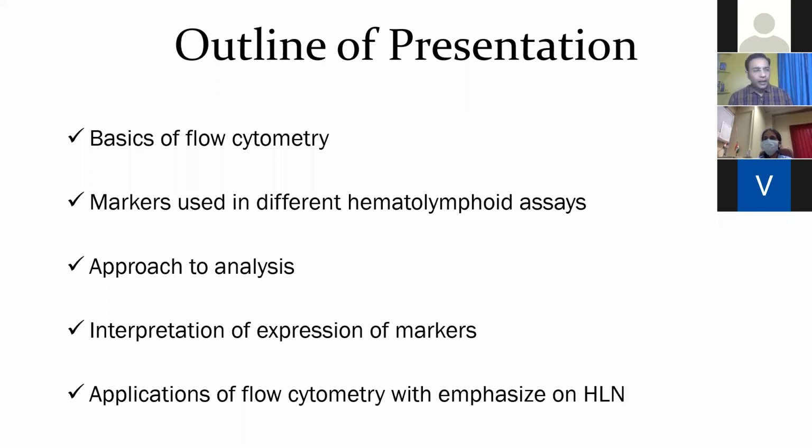And many times you get reports which show what the marker is, and how it is represented in the report, either in percentage form or in expression form. Second, sometimes you can also get dot plots, especially if the patient is referred from one center to another center, we see reports with dot plots given. And as Dr. Manju already said, sometimes it can be difficult or challenging for the interpretation. So I would be covering that part also.